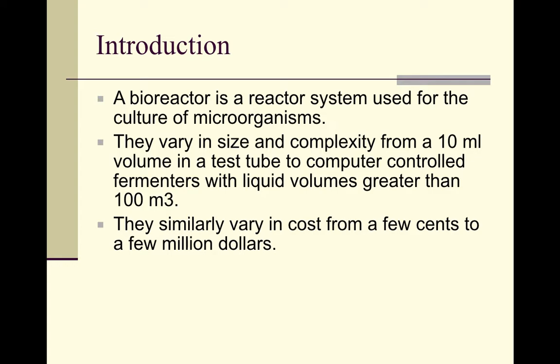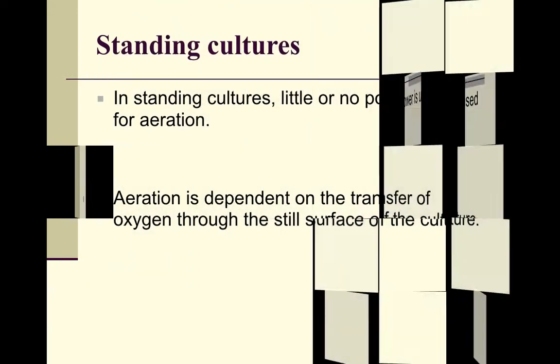So bioreactor or a fermenter is any culture vessel that is used to grow microorganisms under controlled conditions. Now, since we have to control the physical and the chemical conditions for growth, these fermenters are usually very expensive.